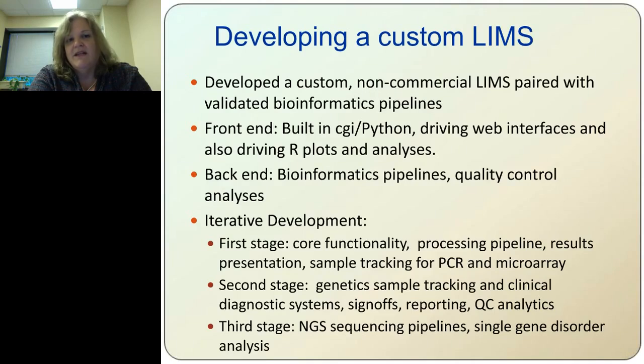All that data is stored in the database, and at the front end of it, when the calculations are complete, you can visualize and browse the data according to any metric that you want to look at. We have several different choices. You can also look at lab performance from the raw data. So we store the raw data, the derived data, and all the metadata, and it all talks to each other. So it allows us to have a lot of control over quality in our data sets, or at least looking at quality in our data sets.